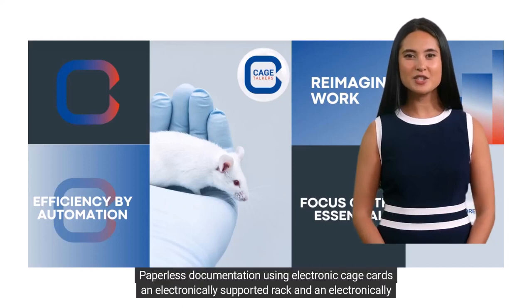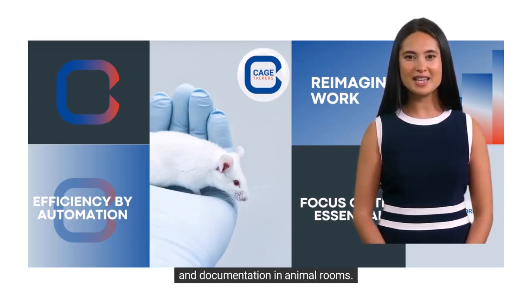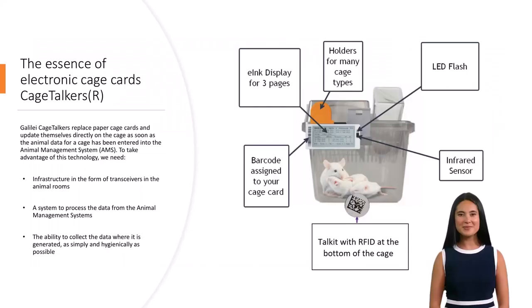Paperless documentation using electronic cage cards, an electronically supported rack, and an electronically supported changing station is changing the state of the art of workflows and the quality of recording transactions and documentation in animal rooms. Let me state a few essentials.